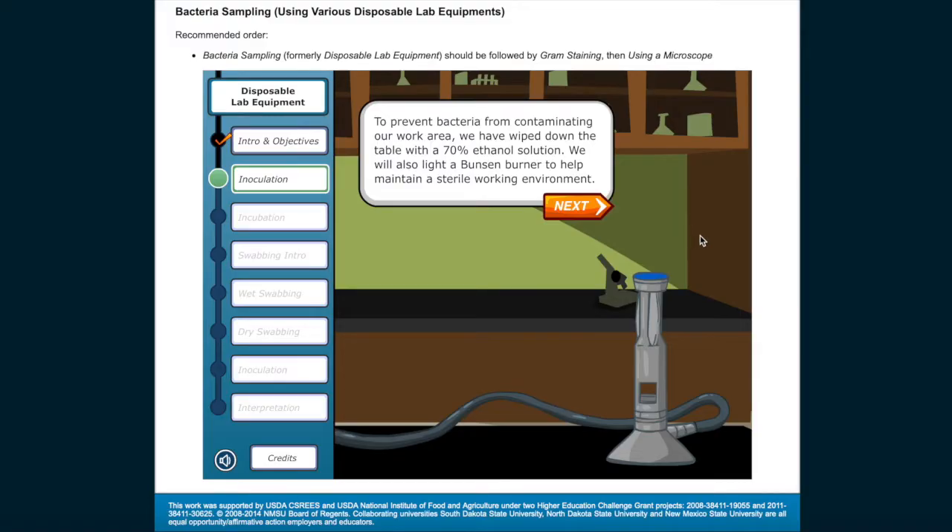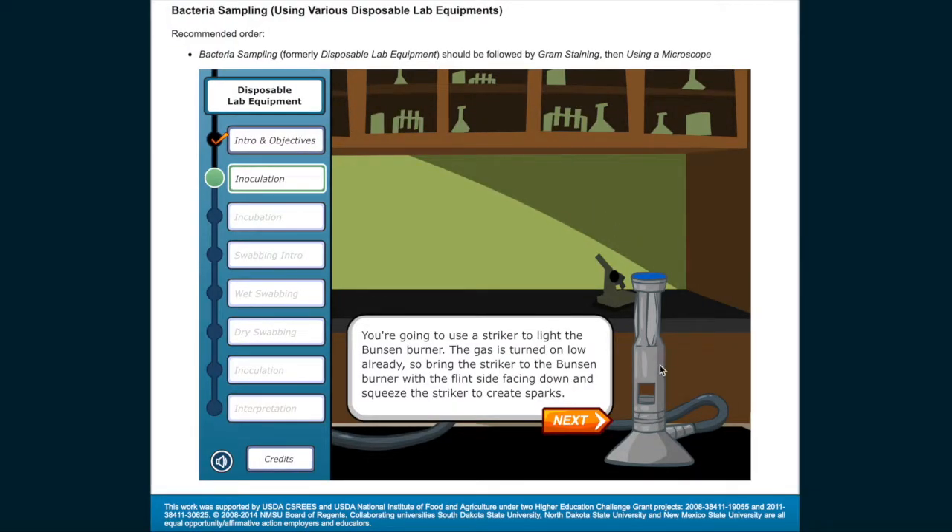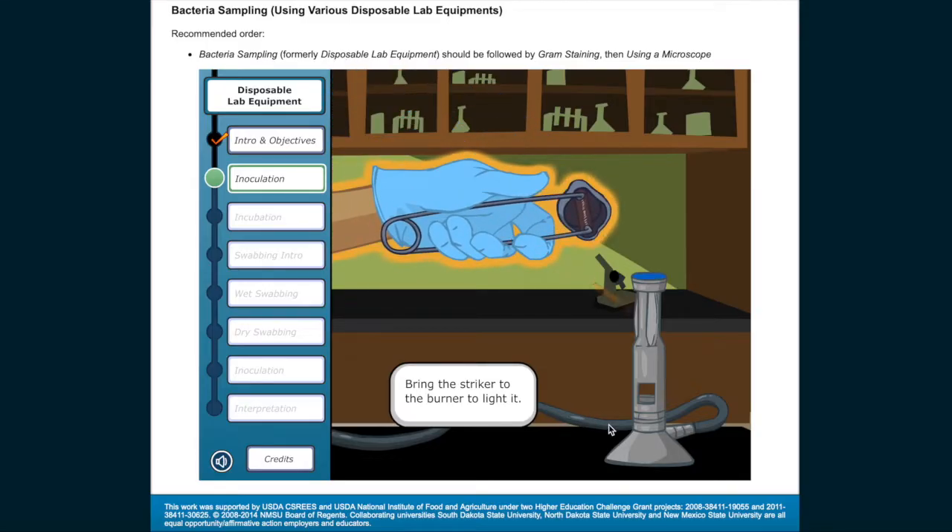To prevent bacteria from contaminating our work area, we have wiped down the table with a 70% ethanol solution. We will also light a Bunsen burner to help maintain a sterile working environment. Use a striker to light the Bunsen burner — the gas is turned on low already. Bring the striker to the Bunsen burner with the flint side facing down and squeeze the striker to create sparks, then bring the striker to the burner to light it.